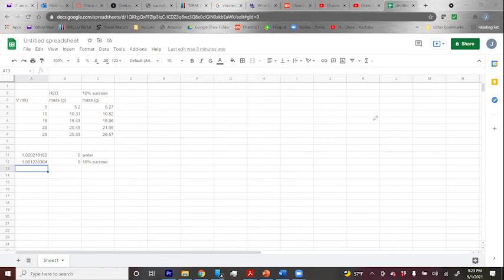If you get 5.49, go, because it doesn't say 5.50, does it? It says 5.5. There are only two significant digits, right? So basically anything between 5.46 and 5.54, you're good. So don't spend half an hour trying to get it to 5.50.